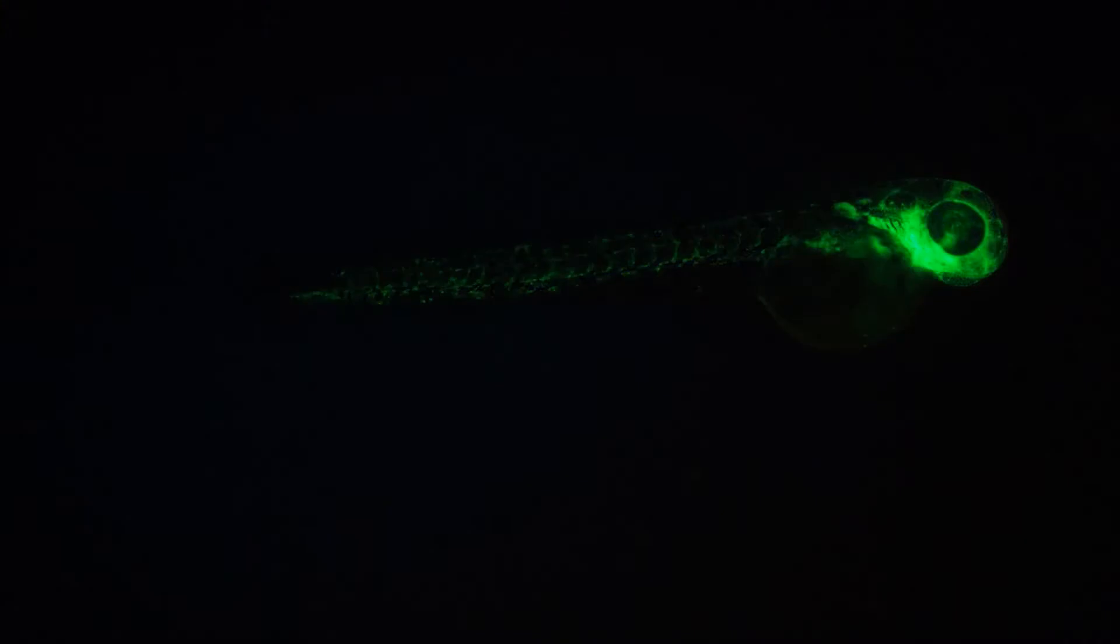So here's the fish before it's fluorescent and here it is afterwards. So now we know that we can use microscopes to look at fish embryos.